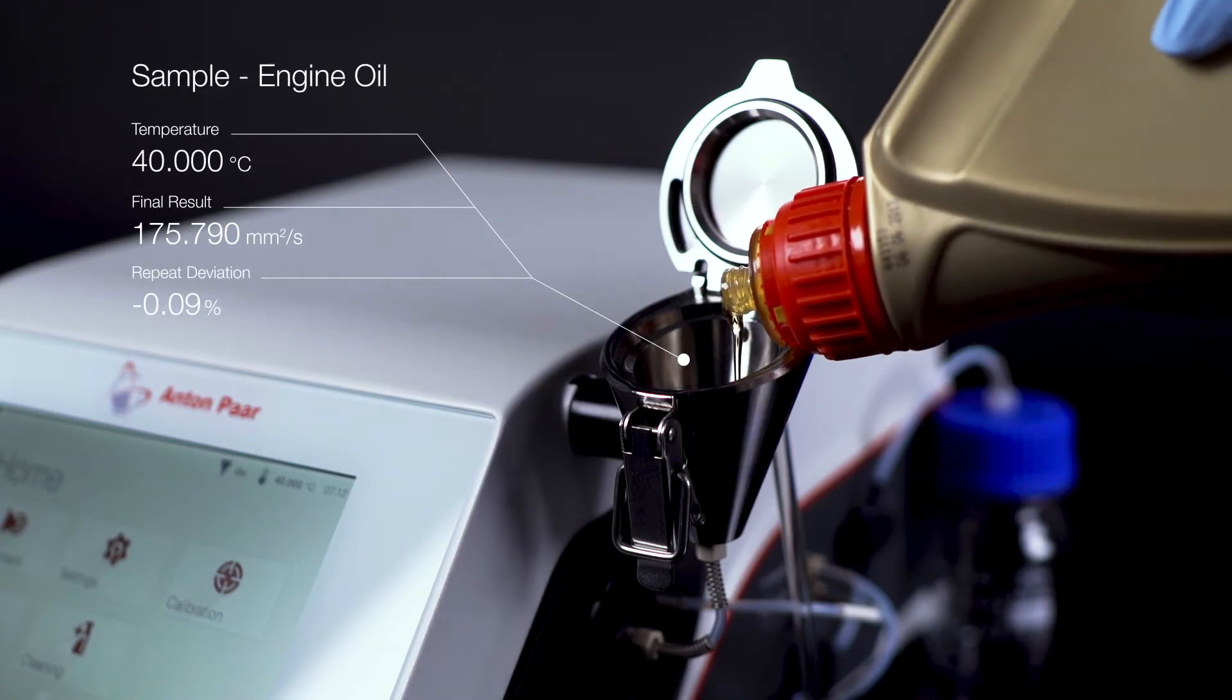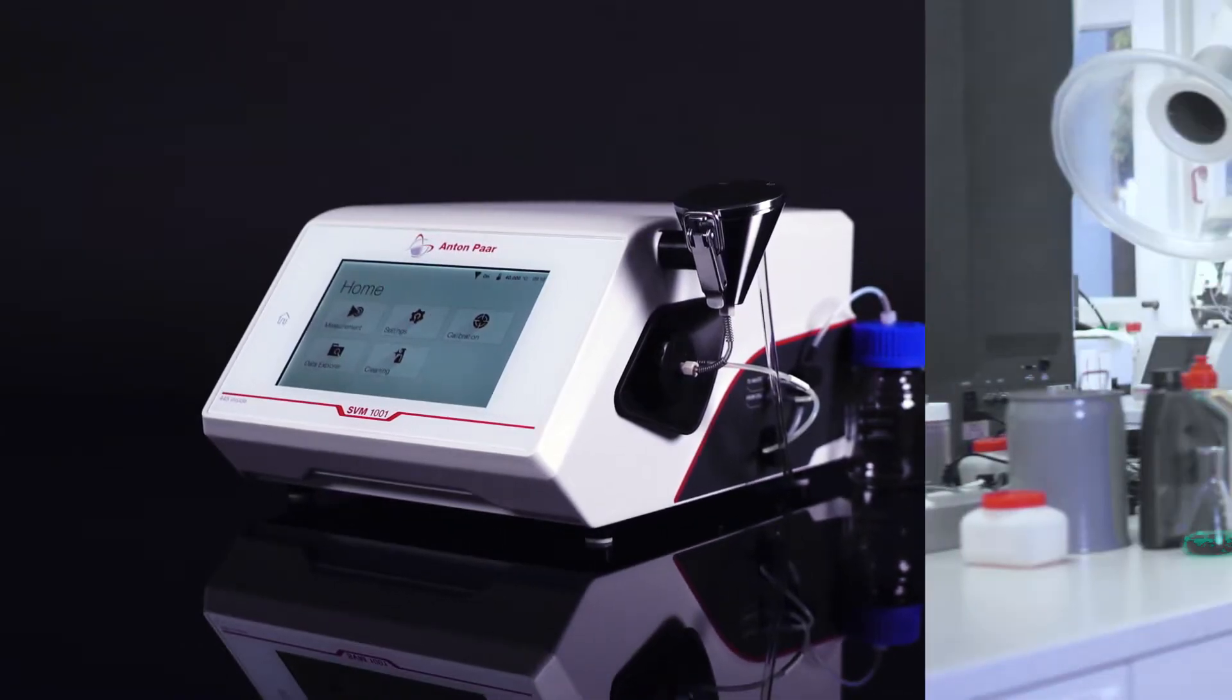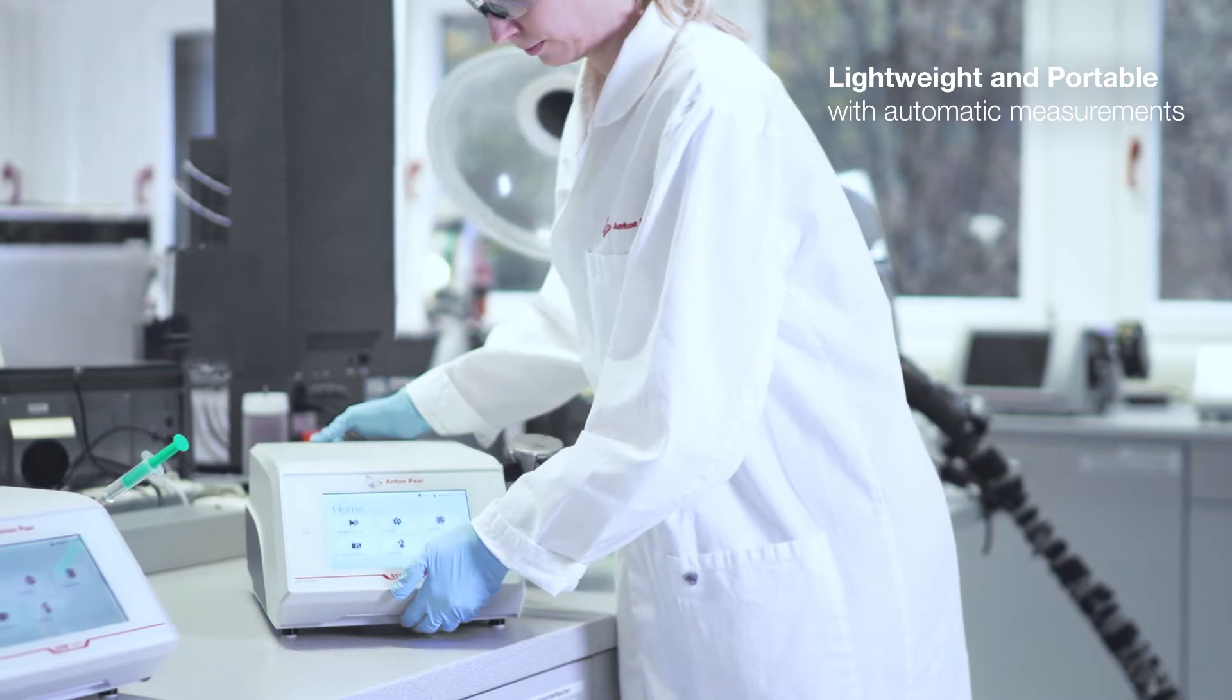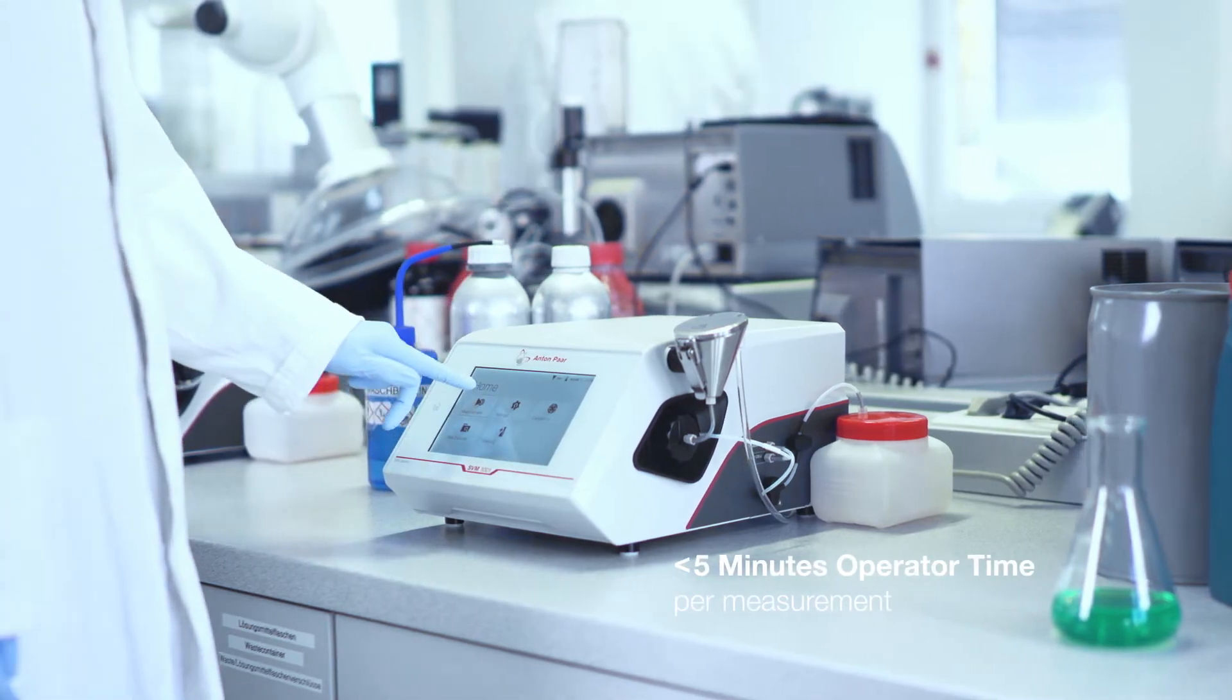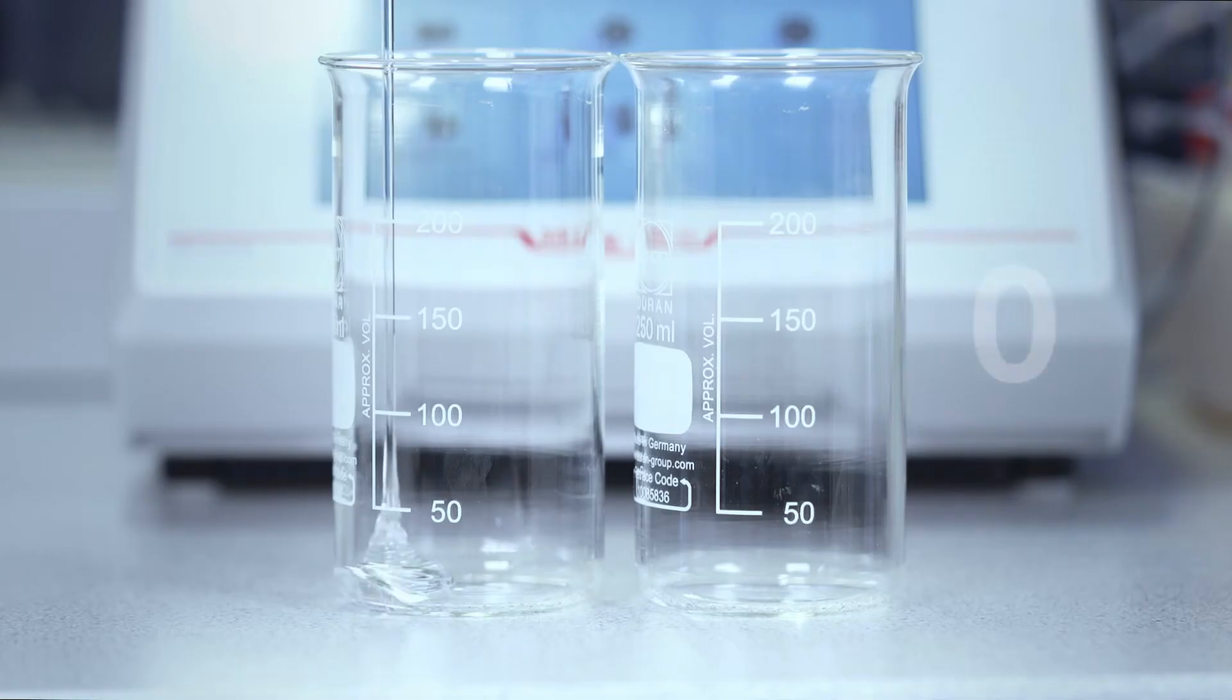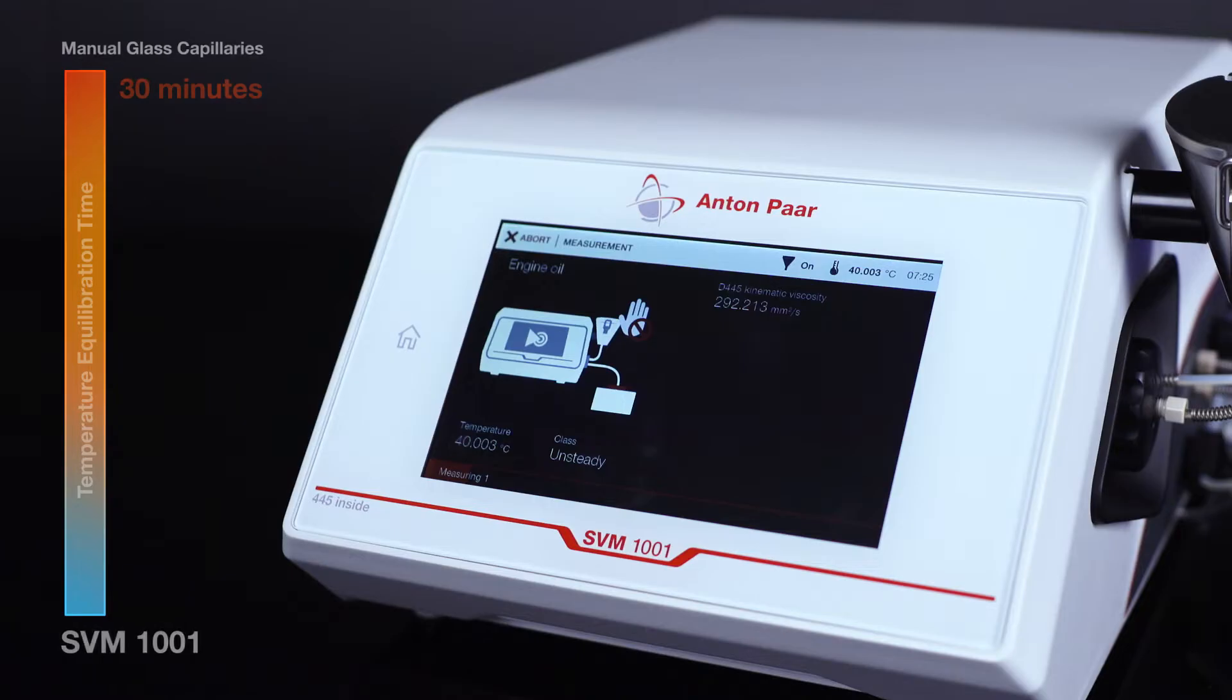Combining trusted technology and the features our customers love most with a price tag making digital viscometry accessible for everybody. SVM 1001 is fast, though in more ways than one: 37 samples per hour, a 1000% quicker temperature equilibration, and effortless super-fast filling.